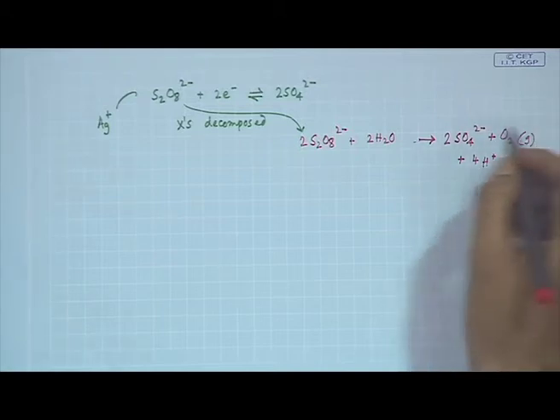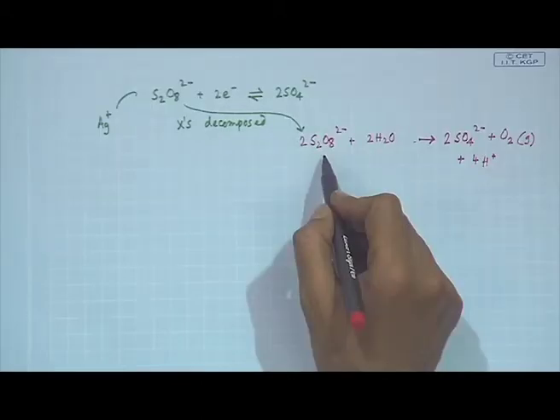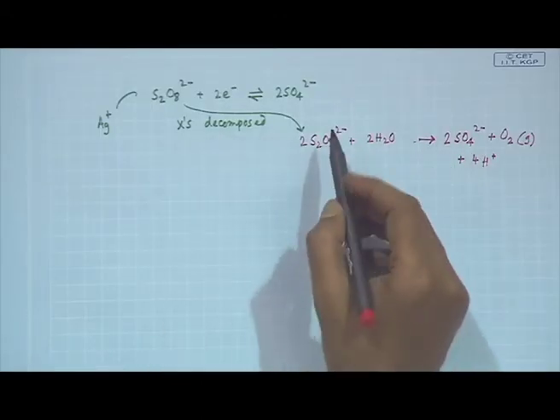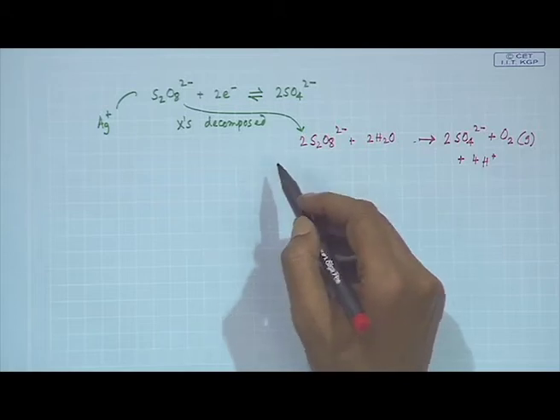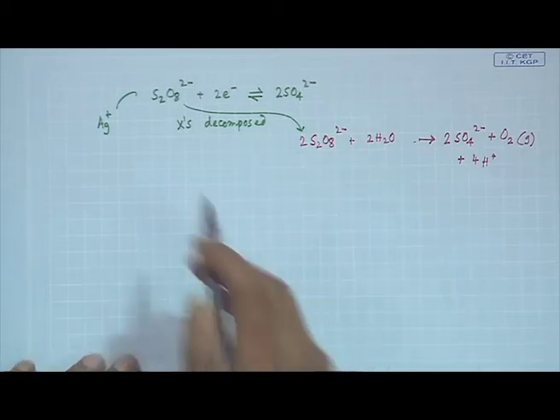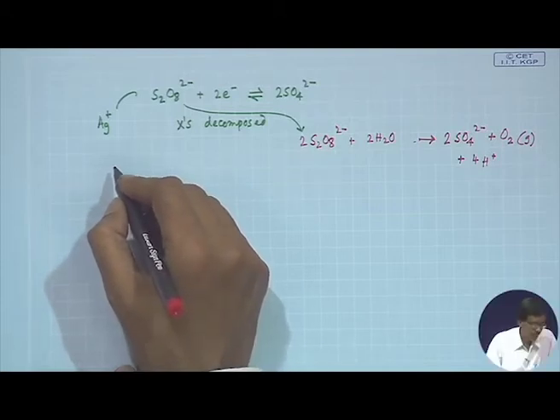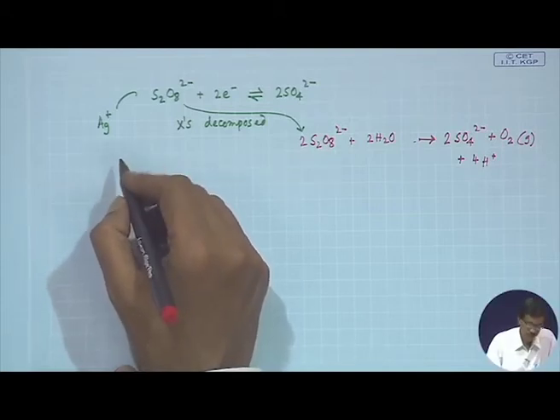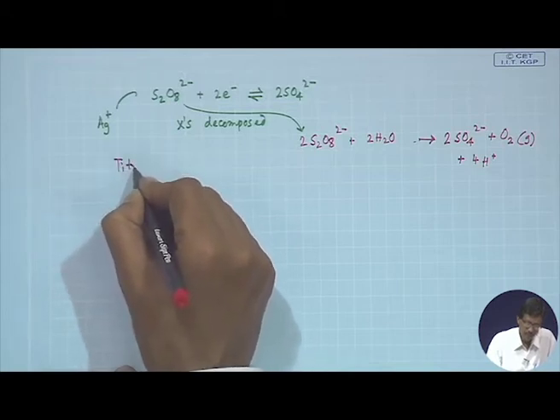That means, wherever we are handling some solution and that solution is utilized for the corresponding oxidation or reduction reactions, sodium bismuthate as well as persulfate can be useful for oxidation. Similarly, we have seen that some reductors can be utilized for reducing the species. If we want to know the certain reducing agents, there is also the choice of the titrant solution.